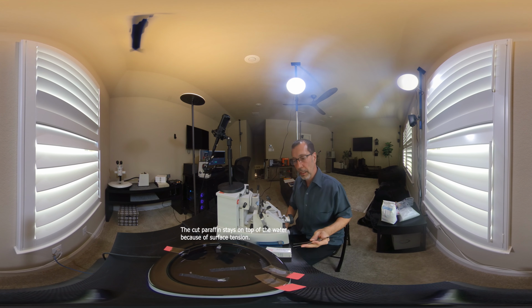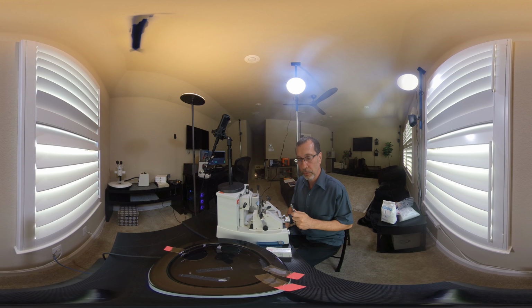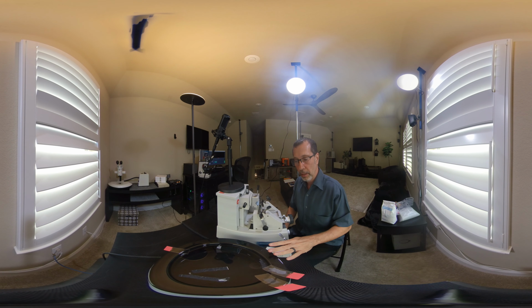So after we cut a piece of tissue and we place it on the water bath, in regards to paraffin, what we really need to think about is that we need to soften the paraffin so that it's flat. And that works well with warm water.